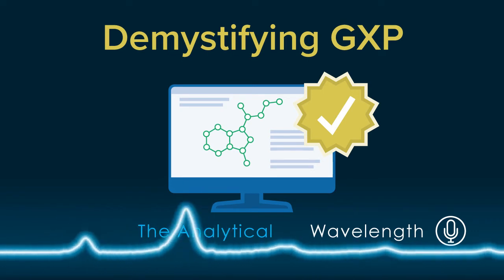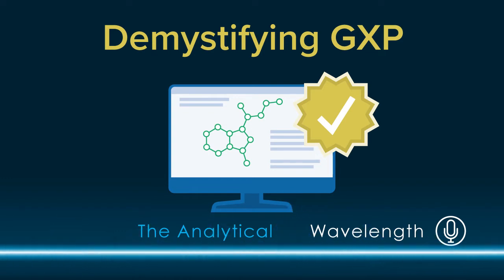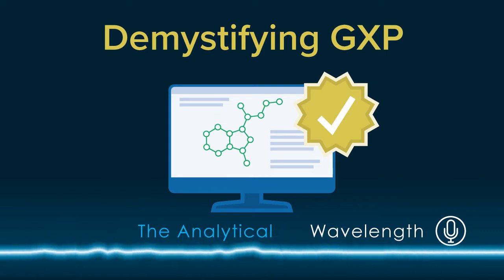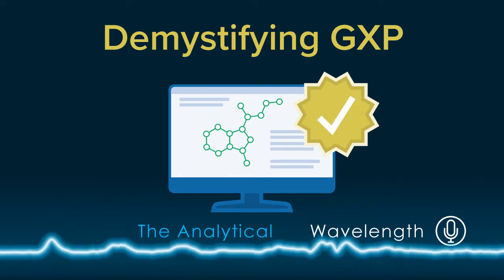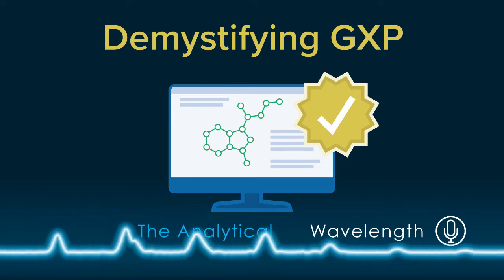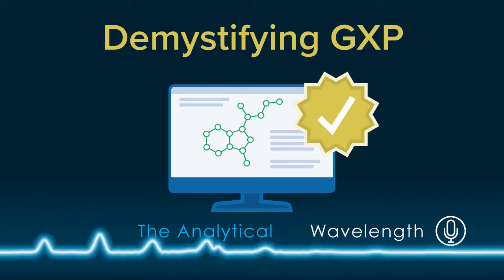Yes, of course, it's a really complicated field, but another complicated field, of course, is good laboratory practices and good manufacturing practices, so GLP and GMP, which is what we brought you on here to talk about today. This is an area that I think that people who are working in industry probably know at least some amount about, but maybe there are people who are in academia who haven't been as exposed to this.